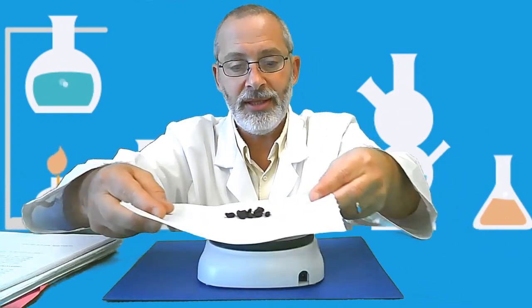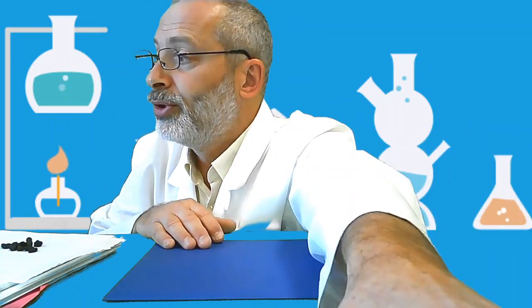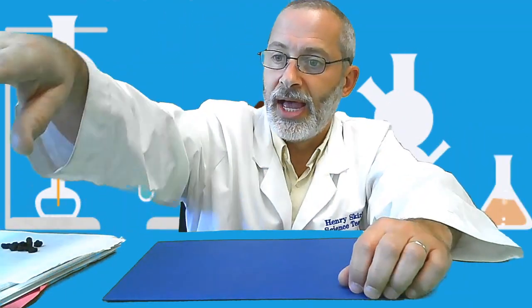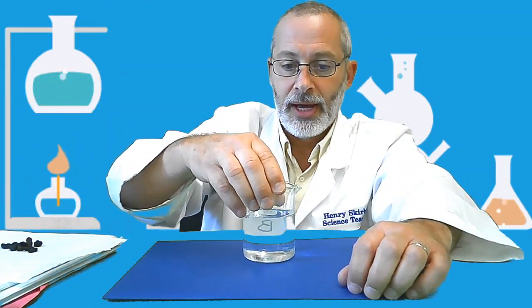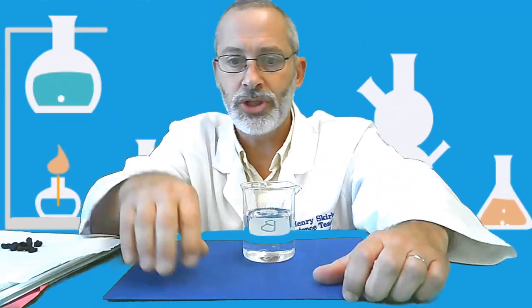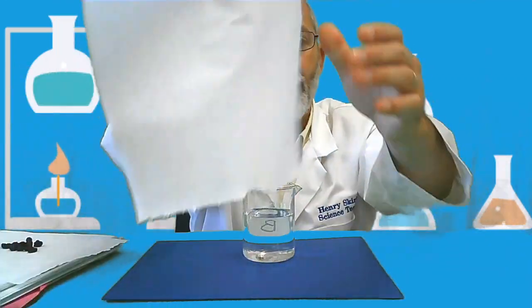All right, so I'm going to take these 10 dried raisins now, and we're going to put that digital balance off to the side, and I'm going to bring in our next material, which is a beaker of water.